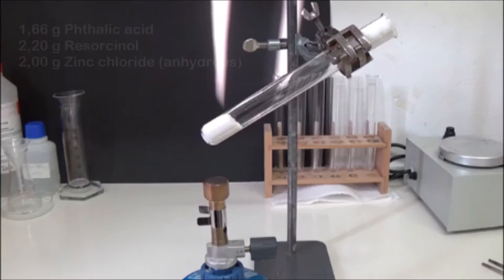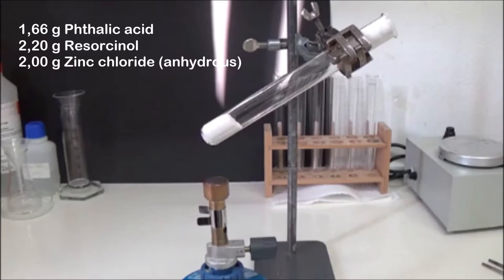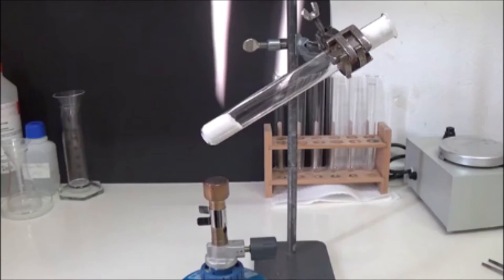Before starting, 1.66 g of phthalic acid, 2.2 g of resorcinol and 2 g of anhydrous zinc chloride were weighed out, ground thoroughly in a mortar and filled into a test tube. The zinc chloride serves as a catalyst and dehydrating agent.